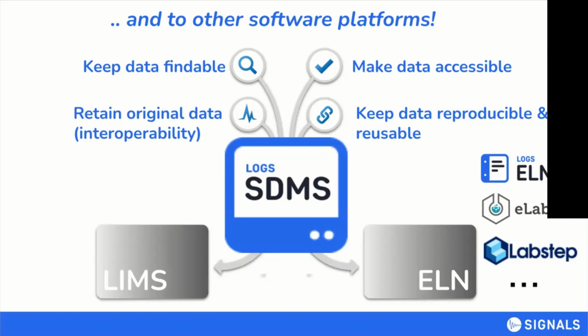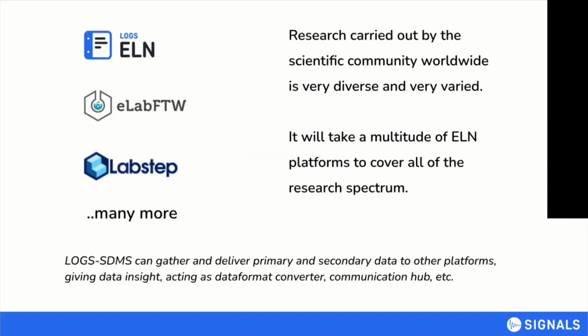And I think this is very important because the scientific data management system is there to gather the data from the instruments. And this, I think, if it's digital, we can gather it and we can work with it and we can make it findable. But for the researcher in the lab, the research is different.